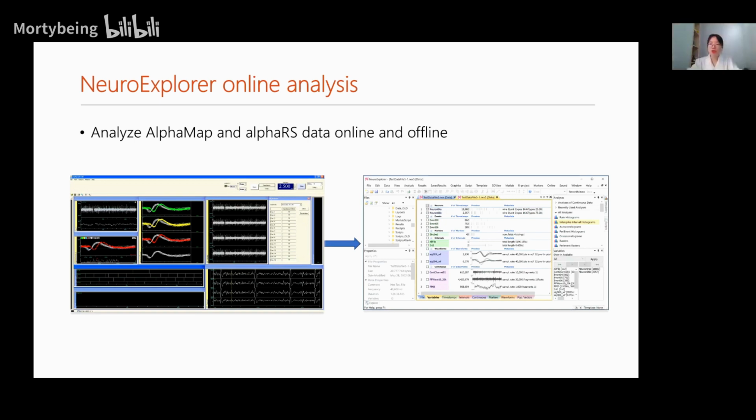I got you. So the online is actually based on the offline. You analyze the existing data, not the real-time data, right? No, it's based on real-time data, but the way it works is based on the software that was originally developed for offline. So you have your online data, but you don't have it scrolling. It just keeps accumulating more and more data points.